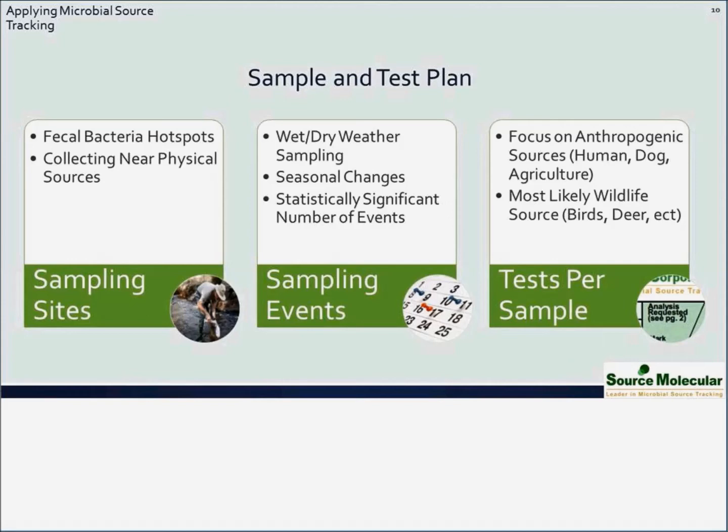Well, that's a discussion. Actually, frankly, that's a discussion between the watershed manager and the regulatory body. We do projects as simple as a handful of samples, and they were meaningful because they were just like discharge from a courthouse, through the roof, E. coli counts, and they sent us a handful of samples. They were flaming hot for human, and the lab thought they just sent us sewage. And they went in and they found the broken pipe. So in that case, just a handful was fine.